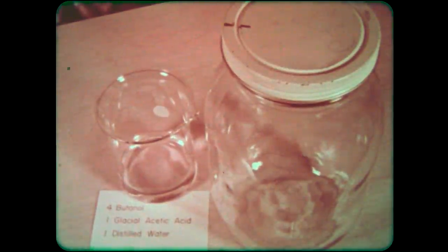Another method of ascending chromatography uses a large mouth gallon jar. The solvent is a four to one to one mixture of butanol, glacial acetic acid, and distilled water. It is poured to a depth of about half an inch.